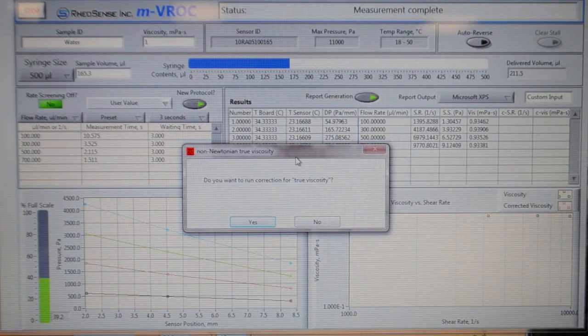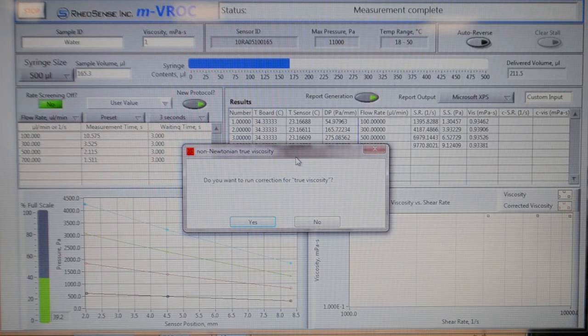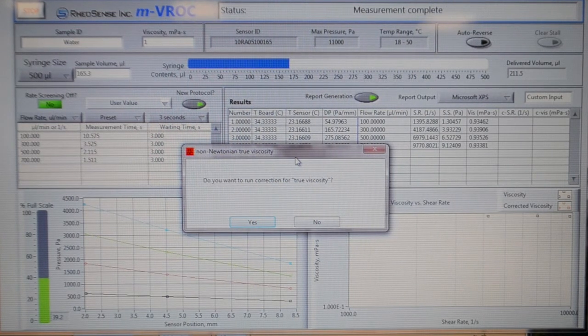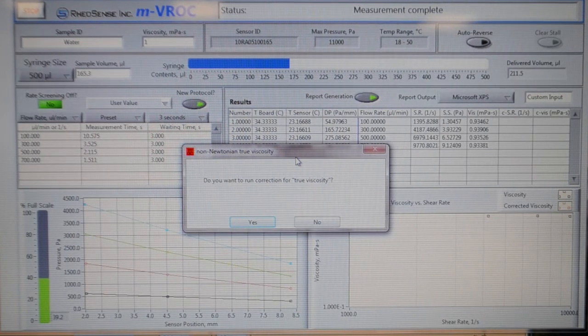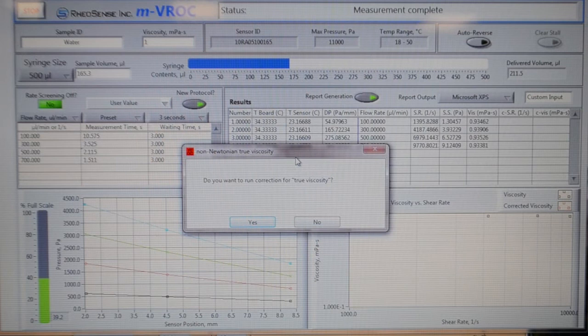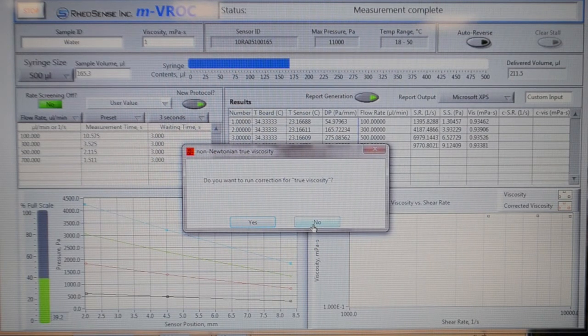Otherwise, if you have a non-Newtonian sample, click Yes for true viscosity correction. Since in this case our sample is Newtonian, we can click No for true viscosity measurement.